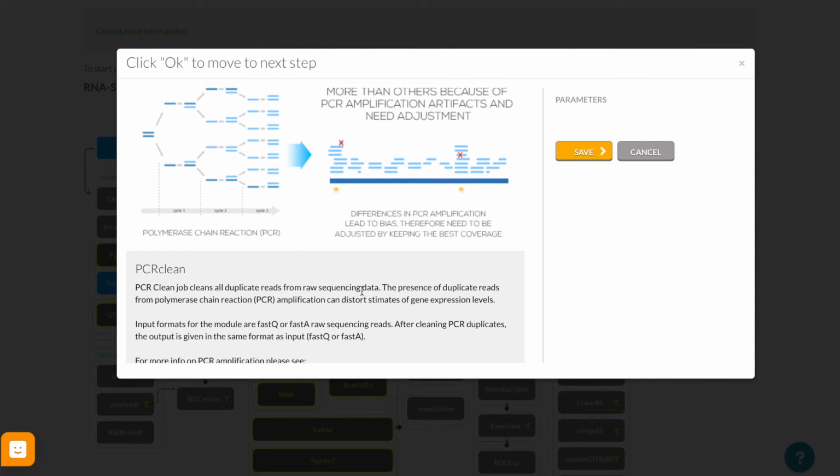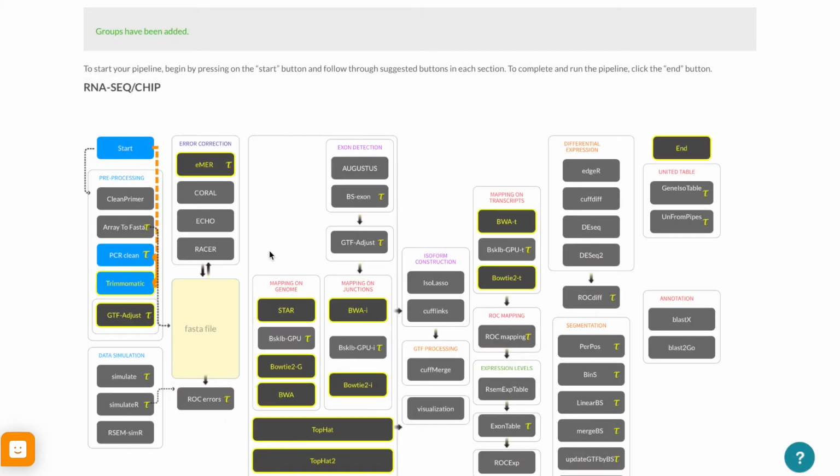The next thing that we want to do is reduce the duplicate reads from raw sequencing data. How do we know that these are technical duplicates or replicates and not actual mapped reads on the sequence? Well, because they all align perfectly in one space. And when they're perfectly aligned, that means that this is something technical, because normally reads are kind of overlapping, and parts mapping here, parts mapping there, and they're different lengths, etc. So this is how we know that this is amplification. We want to get rid of that.